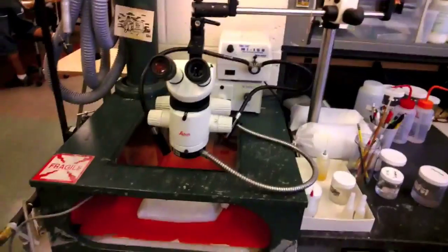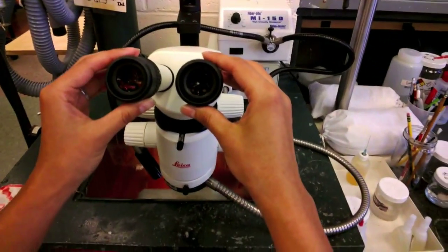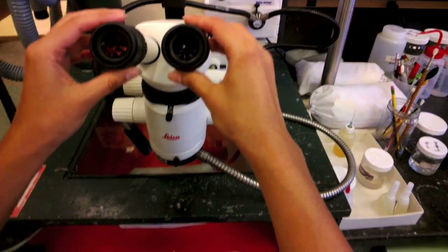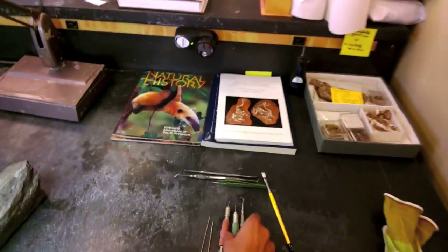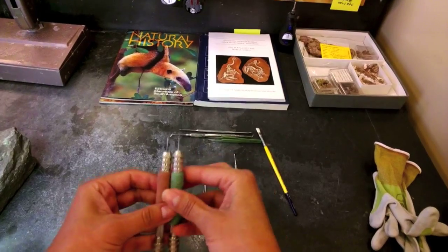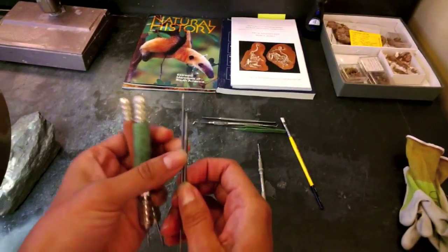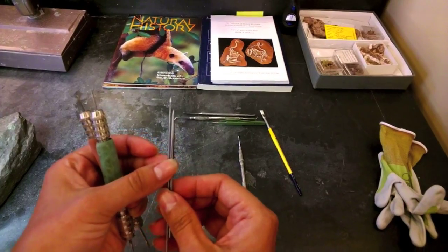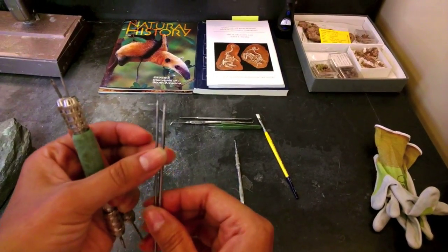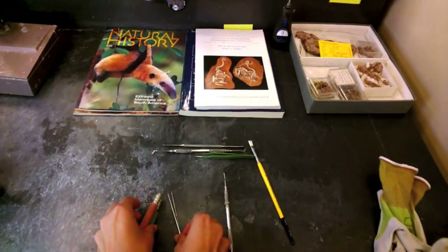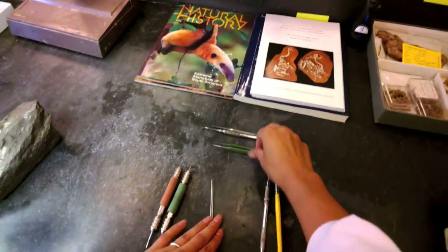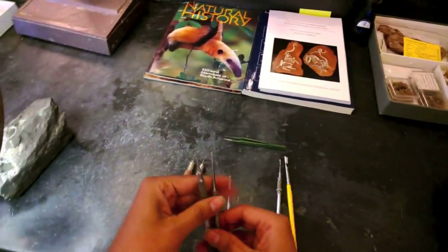Preparators here in the lab normally use microscopes in order to see the finer details of preparation. We also use very traditional and rudimentary tools like these pin vices you see here, and these needles that we have to sharpen every few minutes to get a fine point and fine detail. Brushes of course, and tweezers and other dental tools as well.